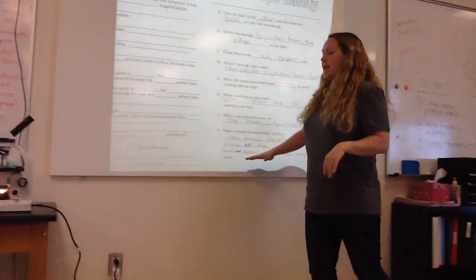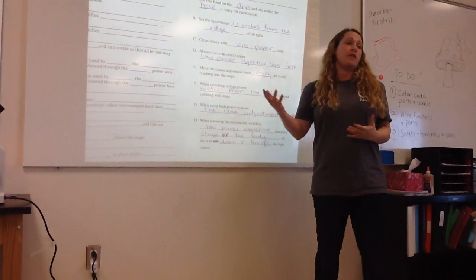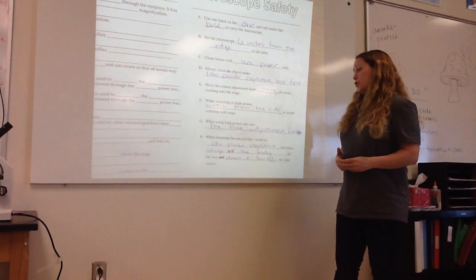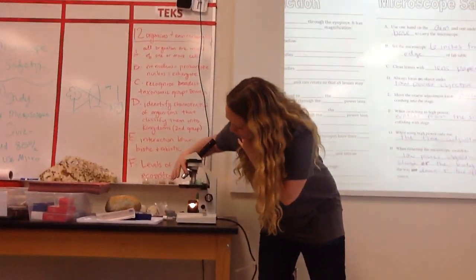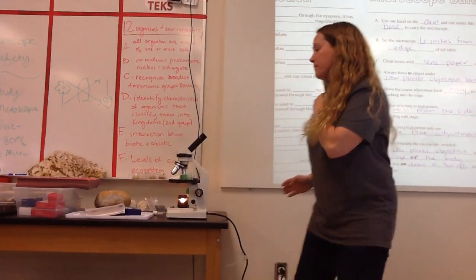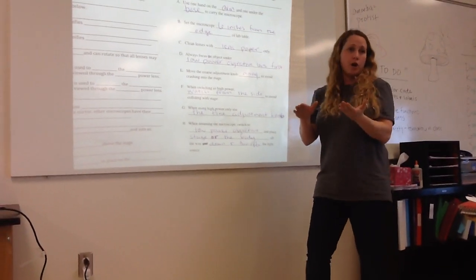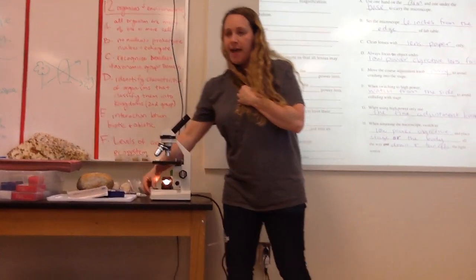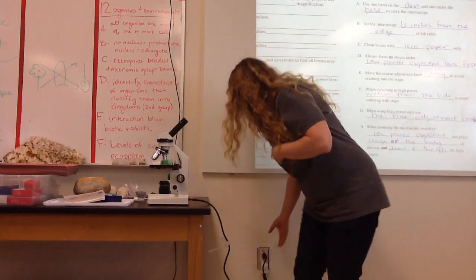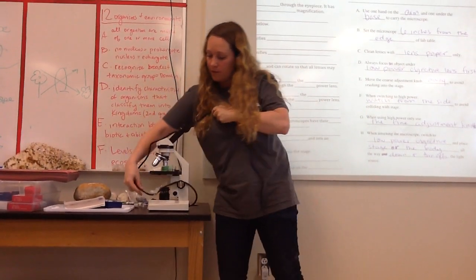Okay, the last thing, it's easy to forget, but it's what causes the microscopes to run out of power and the lights to burn out. So make sure that you put it back on low power by turning the nose piece to the short one, like that. Then make sure that the stage or body is all the way back where it goes. So swivel that. Last step, turn off the light. If you're packing up for the end of the day, you unplug it and you wrap it around it like this.